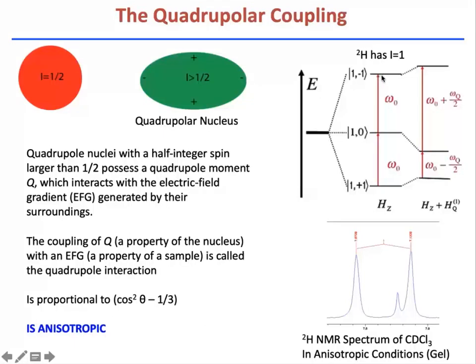When you have this interaction with the electric field gradient, it oscillates depending on the orientation, and it also averages out in isotropic solution. But again, when the sample is exposed to an alignment medium, then you see a fraction, and this fraction is the residual quadrupolar coupling, because the quadrupolar coupling is very large, as is the dipolar coupling. And this fraction is what we normally use to check the sample.